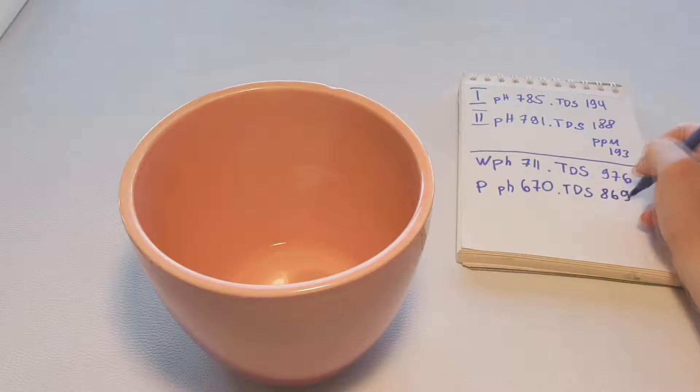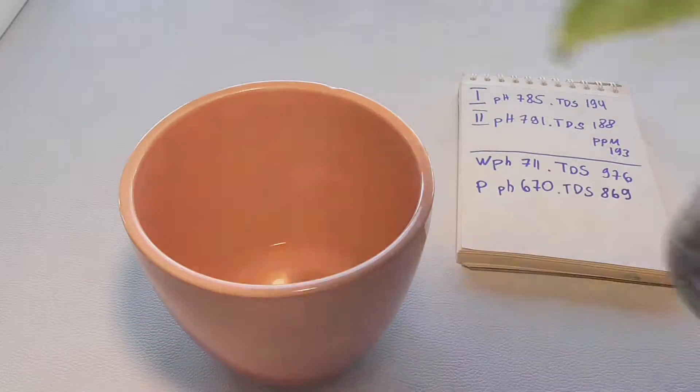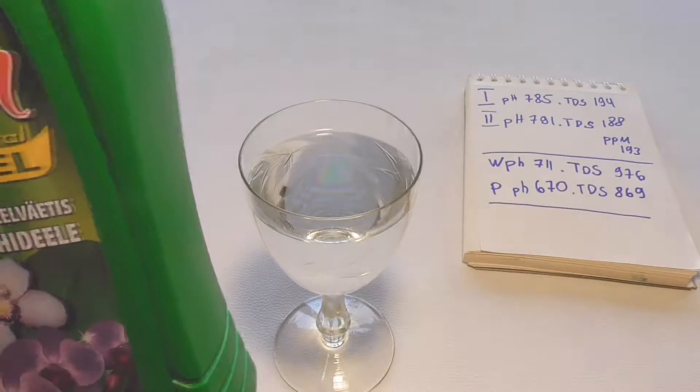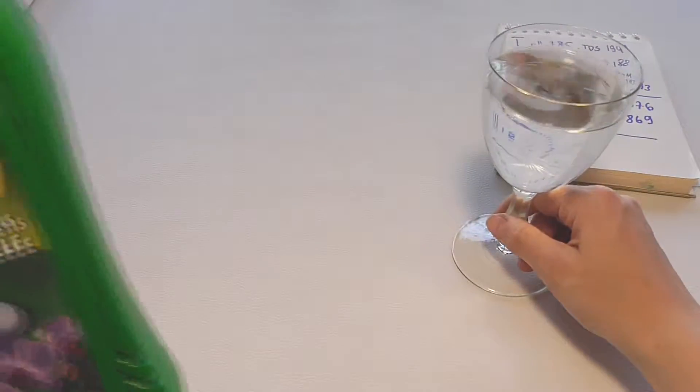I just put it into the water that is at a temperature of 25 degrees. It is easy to use. Simply immerse the pH meter electrode in the solution to be tested. Readings are quickly displayed on a large LCD display.